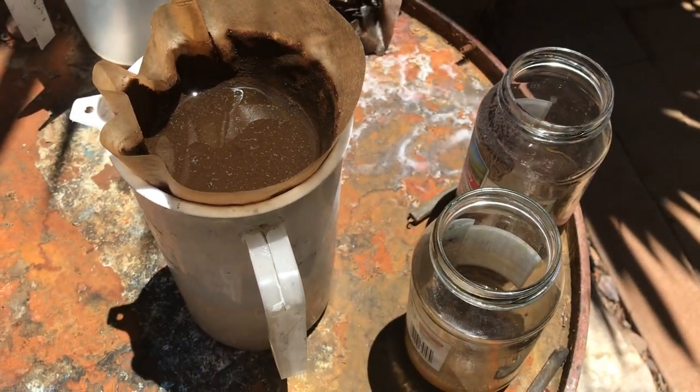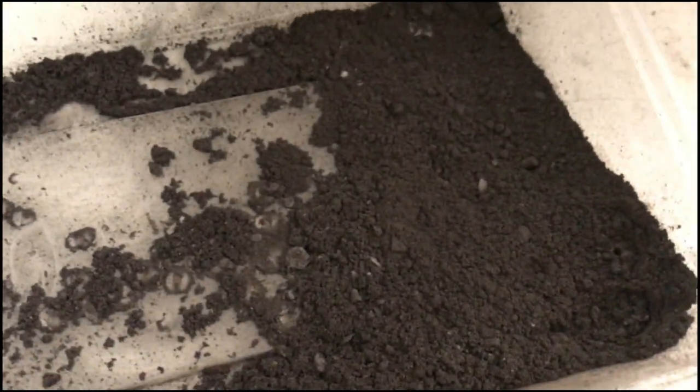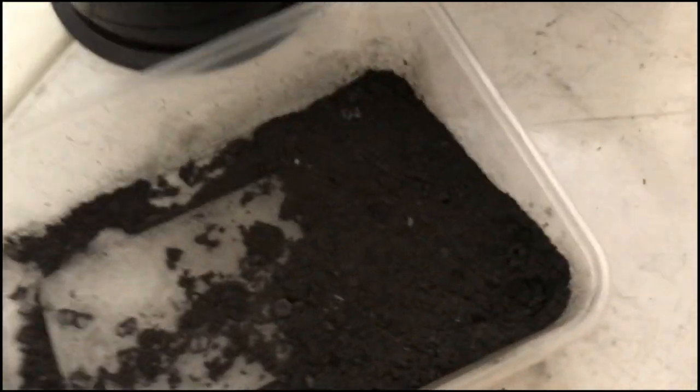The large rocks are too contaminated — nowhere near pure enough. That was the 96% graphite content sample, and this one was the final rock form, which is much better than the large rock sample.